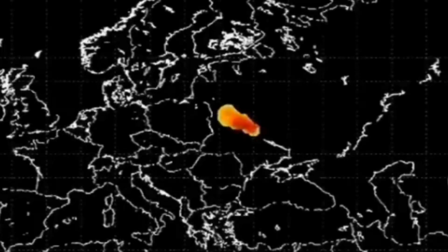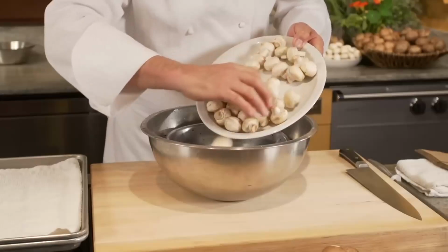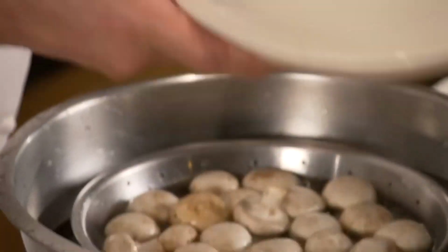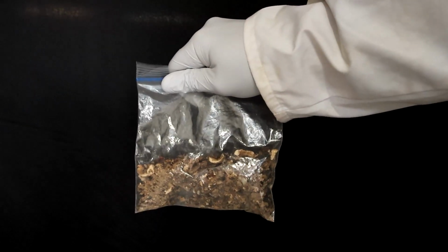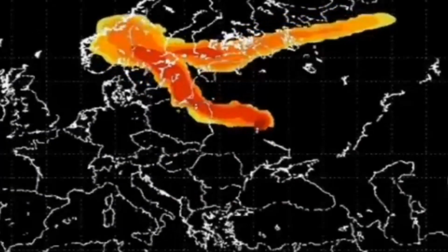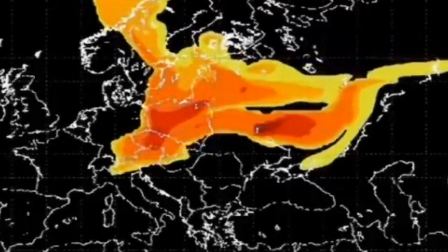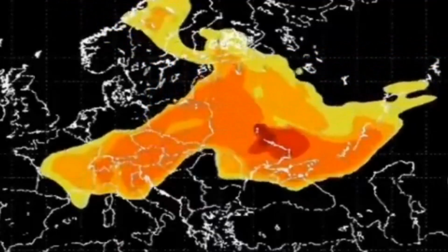To complicate things, we know nothing of the mushroom's life story or collection site. The handling could have introduced or removed some isotopes, and this bag could be from different batches of mushrooms collected in different spots, and maybe at different times as well. So is this whole study a waste of time? Yes. I am just an idiot confirming what smarter, richer people have done far better.